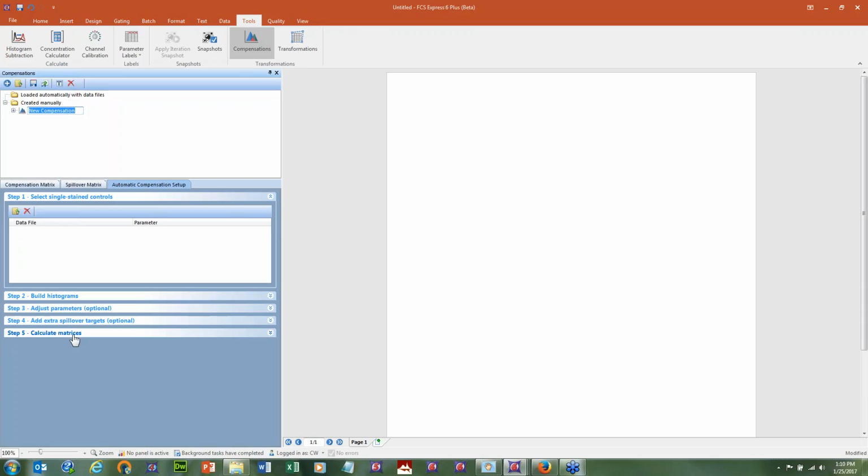Okay, and I see a question about can we change the compensation of 2.0 data files by creating new compensations? You can add a compensation to it, but you cannot remove the pre-acquisition or the during-acquisition compensation that was applied.